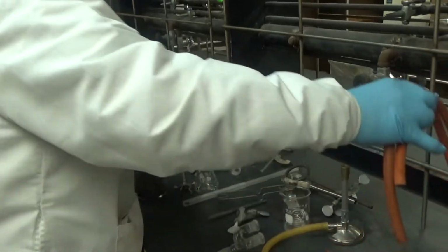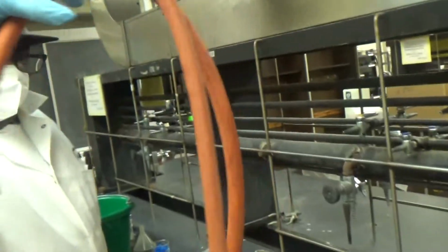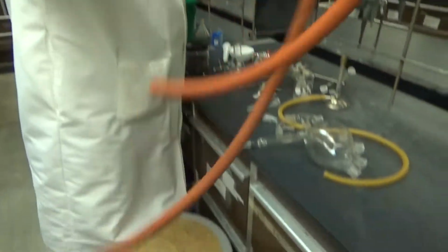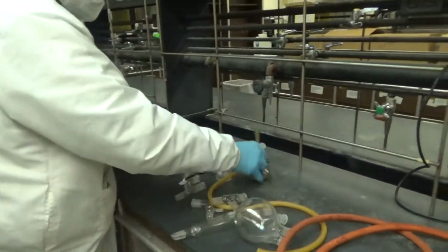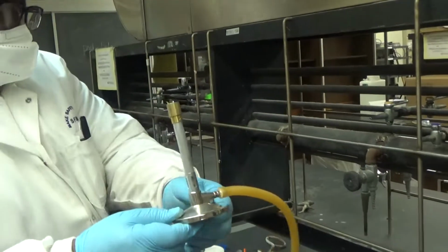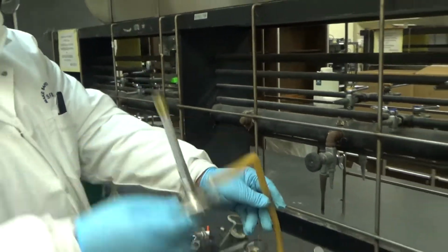You are going to need 2 hoses. 2 rubber hoses. And a Bunsen burner. Bunsen burner.